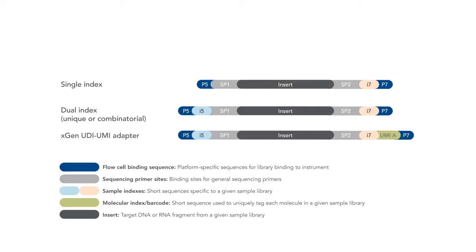Okay, so we're going to start with just the vanilla flavored adapter at the top. Library DNA adapters are going to have sequences which will allow our pieces of library DNA to hybridize to the oligos that are already stuck on the flow cell. That will be the first step in getting them to become attached, amplified, and sequenced. And we also have to have sequences that will bind sequencing primers that we can use for that purpose later. There are other things in there if you're going to have complicated mixtures of samples for indexing purposes, to later identify which sample came from which.